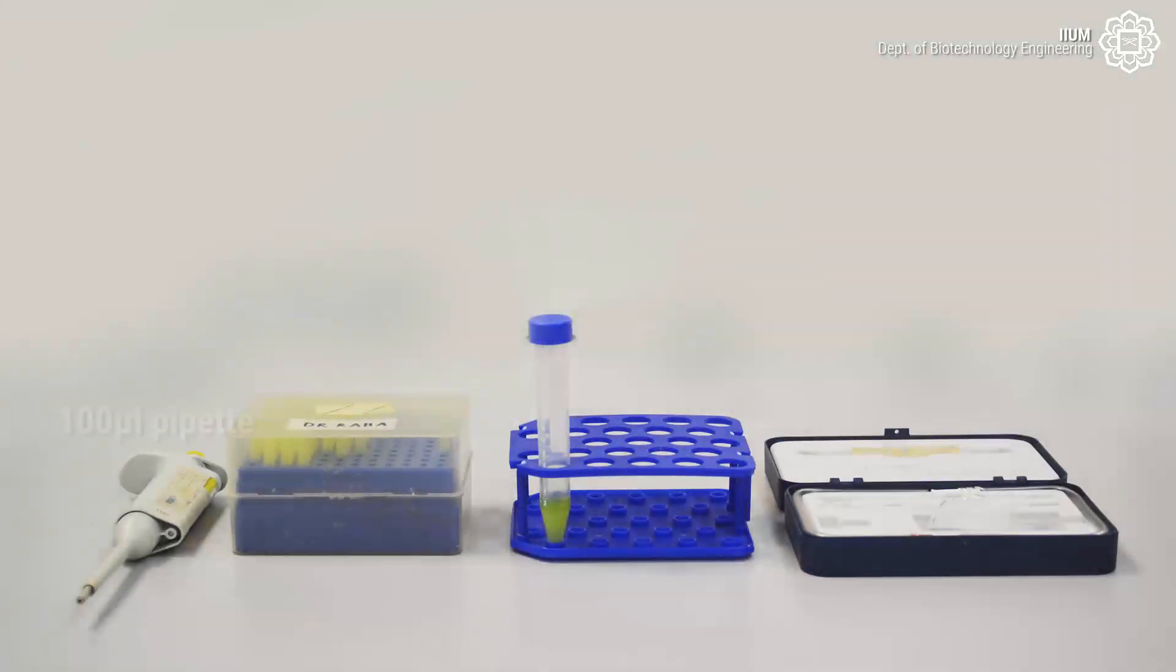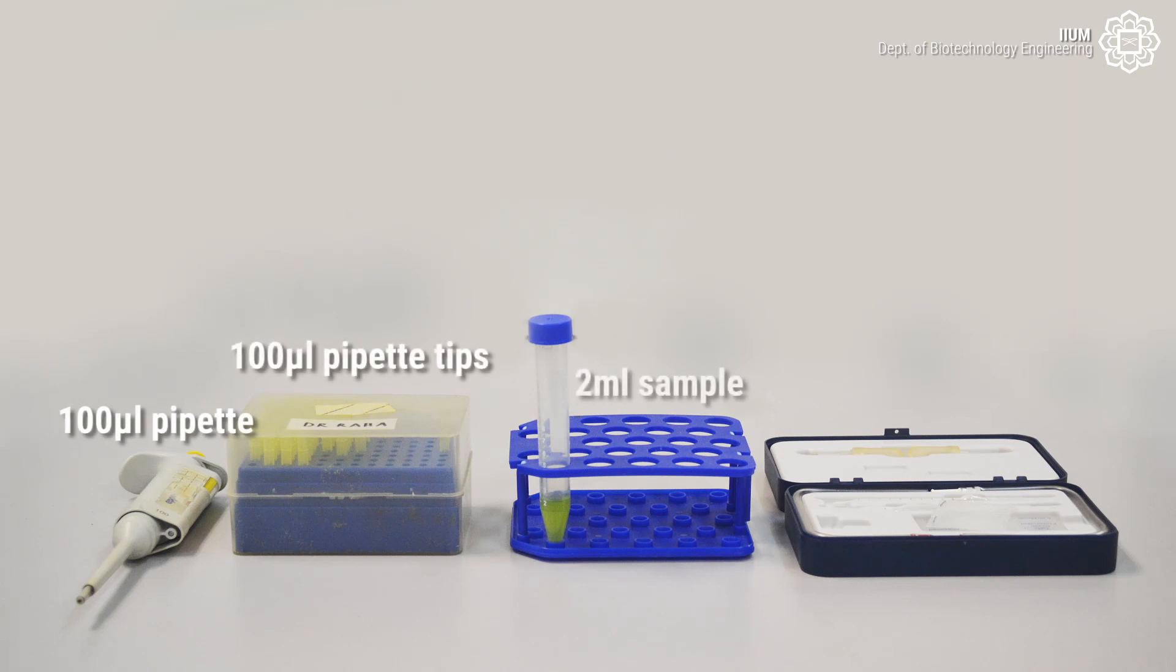For cell counting, we need 100 µL pipette, 100 µL pipette tips, 2 ml sample, and hemocytometer.